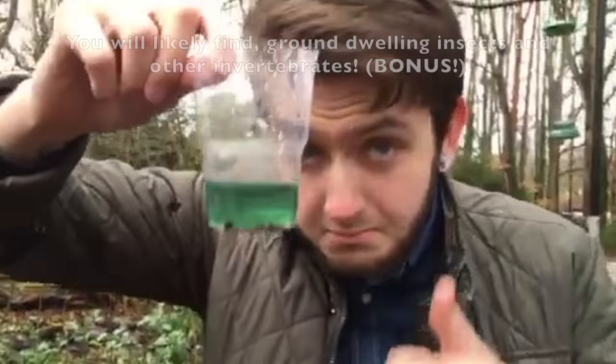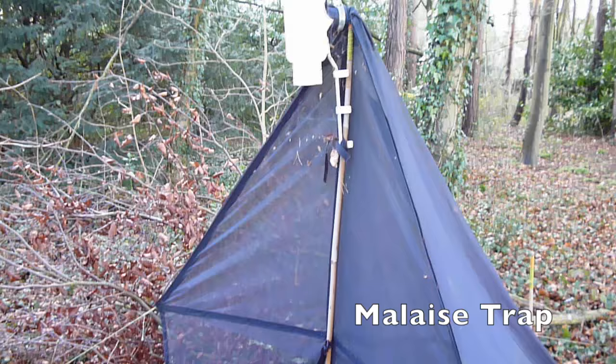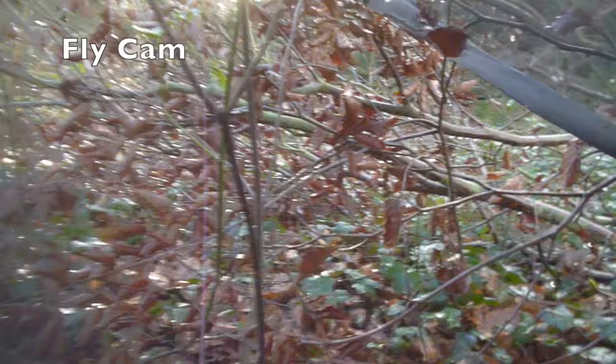The last method is the malaise trap, which is used to target flying insects including bees, wasps, and flies. The workings of this trap will be demonstrated by flycam. Insects fly heads-down into the trap, proceed to hit an inner membrane, and as insects of this order tend to do, fly upwards and into a collection tube.